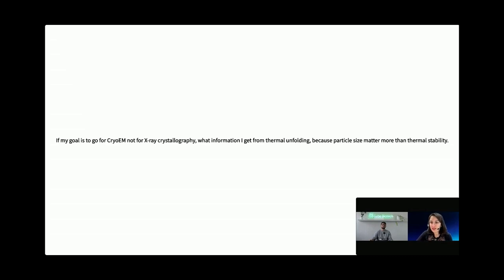So, trying to address as many questions as we can, we have a little bit less than 10 minutes left. Another question, still on the topic of structural characterization, is about differences for membrane proteins purified using the Cubipol copolymers, or, for example, standard copolymers like SMALP or SMA-LP, I'm not sure. The SMALP is just the name for the particle. As soon as you add the SMA and it forms a nanodisc, it's then called a SMALP. It's just this lipid particle.